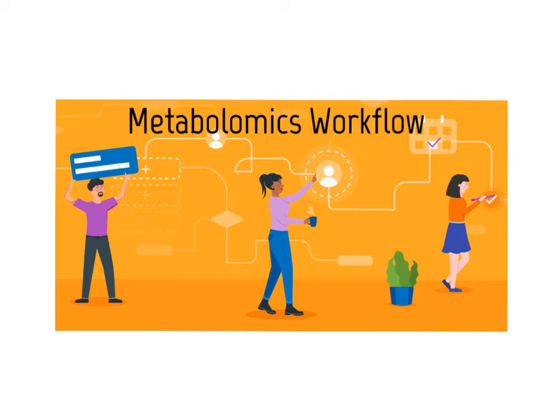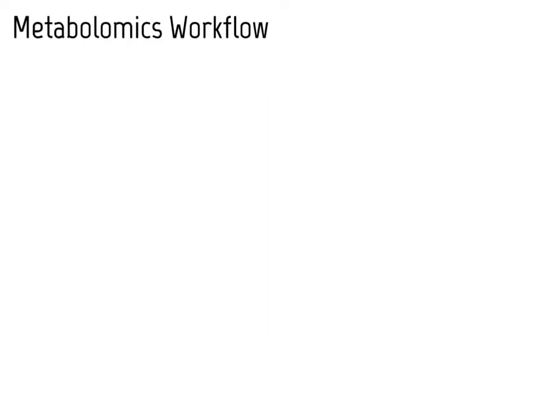By the end of this, you should be able to provide an overview of a general metabolomics workflow and apply that toward answering questions related to conducting metabolomics experiments. What I'm going to do is break down the metabolomics workflow one step at a time. So the first step of the metabolomics workflow is actually collecting the sample and extracting that sample.